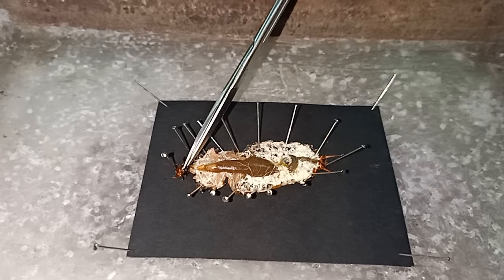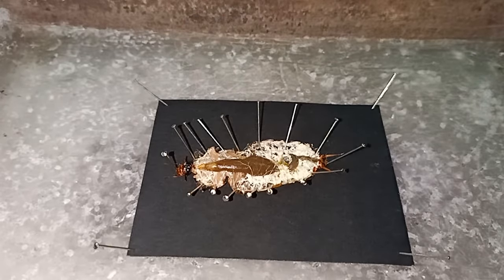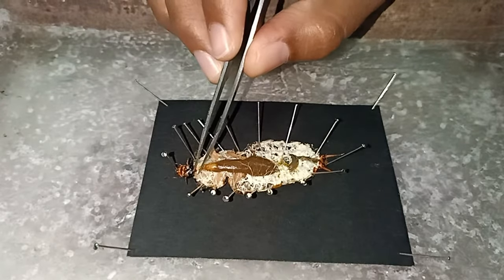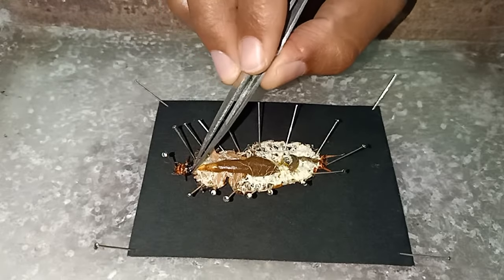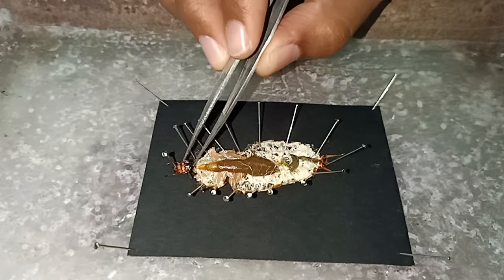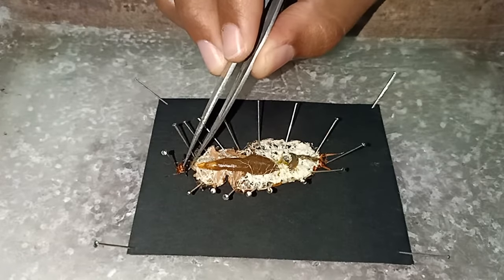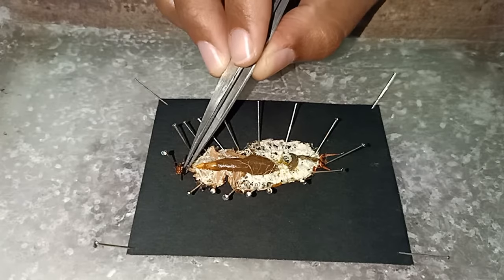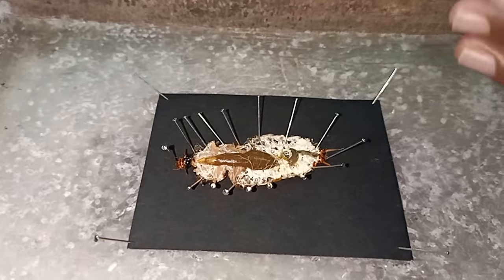The main part in the nervous system dissection is the exposure of the brain. We must gently make a slight cut on the head region to expose the brain. An important note, we must be very careful while making an incision around the head near the clypeus and anterior epicranium to expose the two cerebral ganglia, which is nothing but the brain of the cockroach.